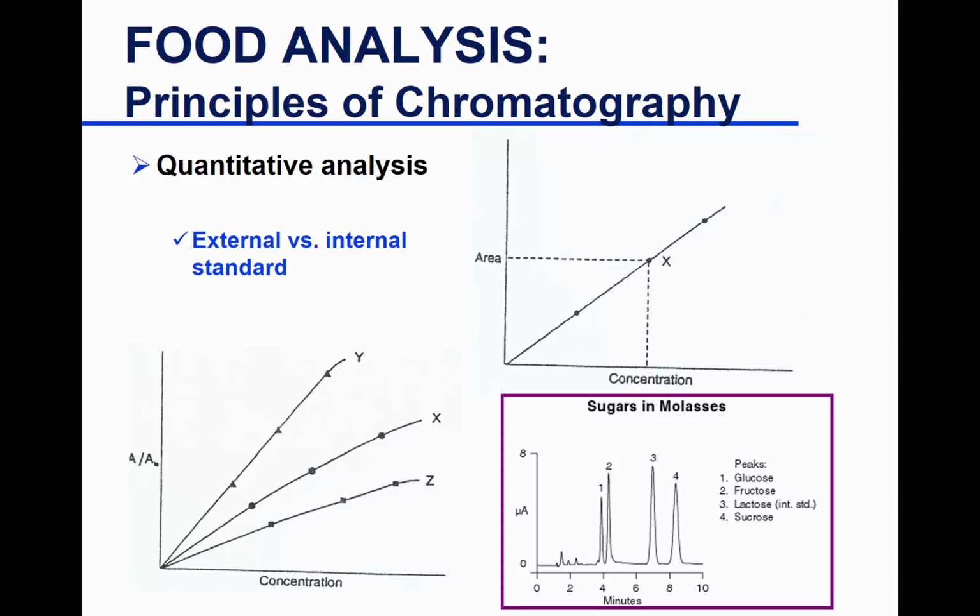Okay. Yes, Zach? Could you go back to the beginning? So you said internal standards are not always needed for quantification, but they're needed for what? The internal standard? Yeah. They are needed for enhancing precision and accuracy because they go through the same process of preparation as your sample. So if you have any errors or losses during sample preparation, internal standard is what can account for that. So enhancing accuracy and precision is the job of your internal standard.